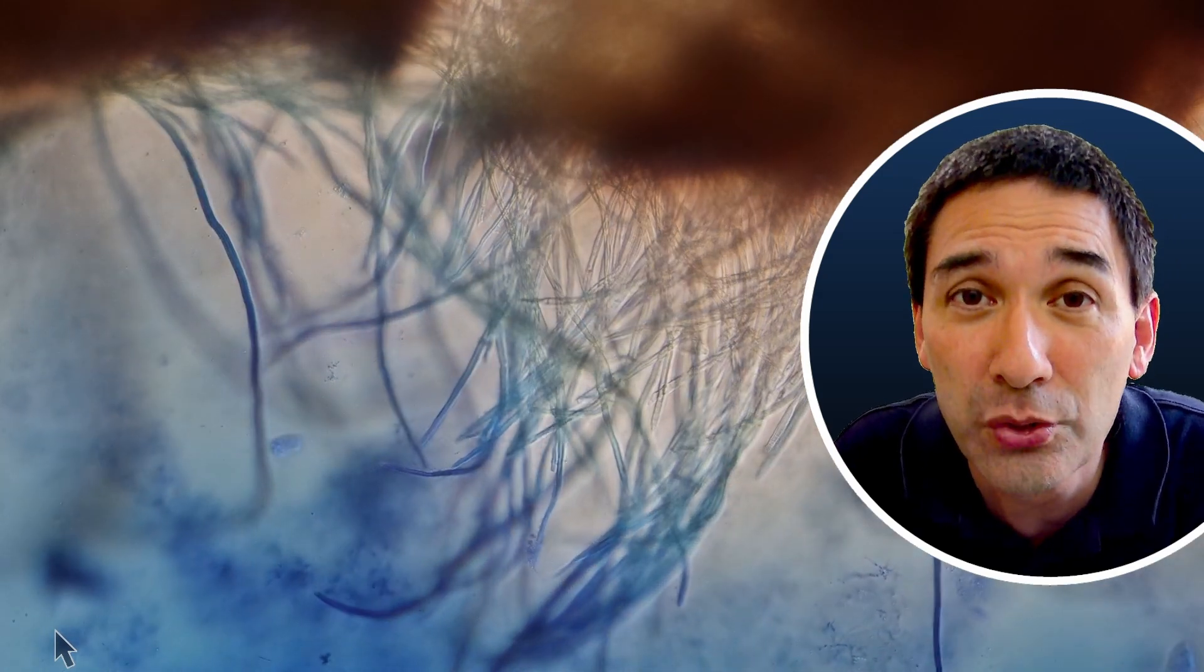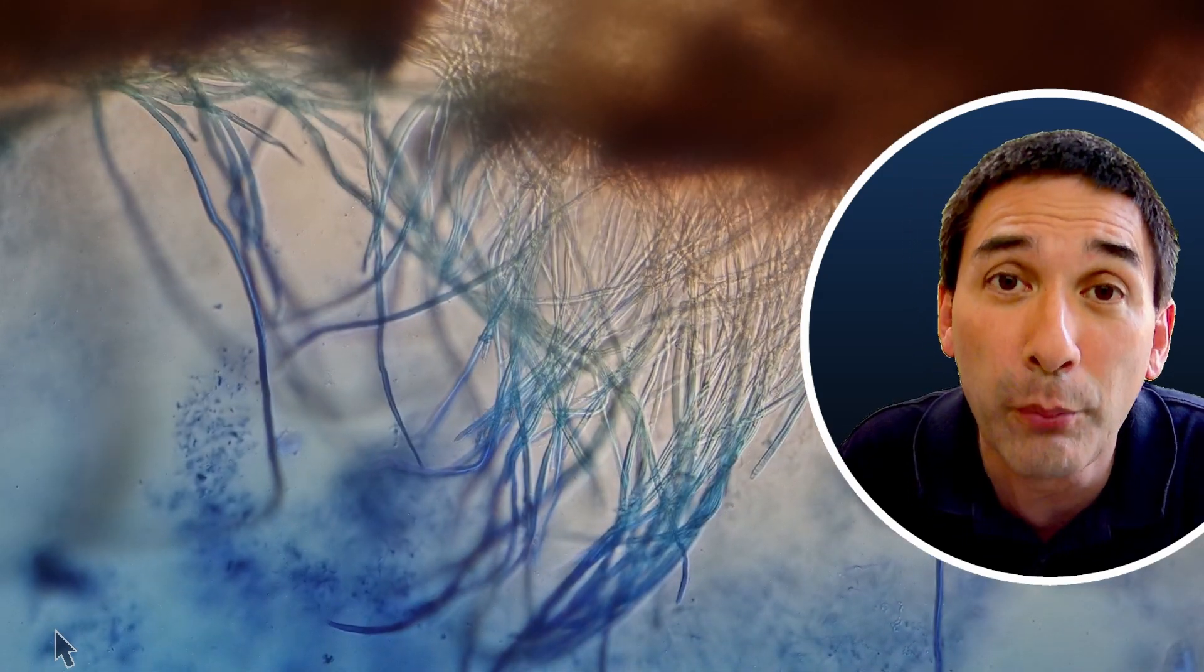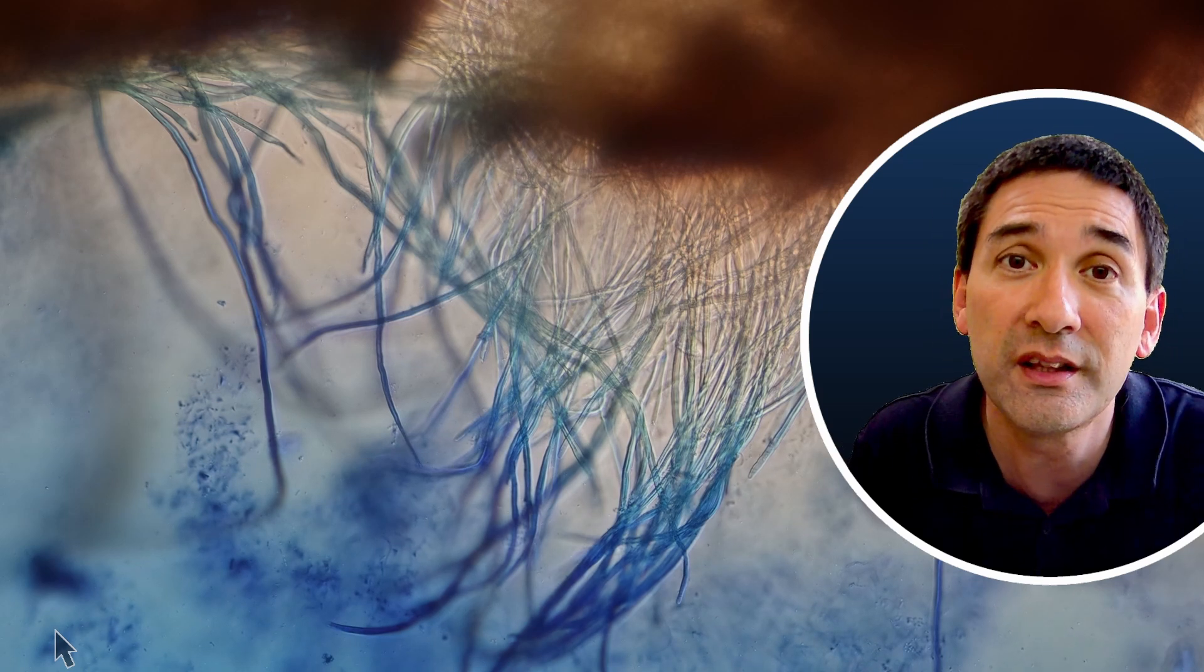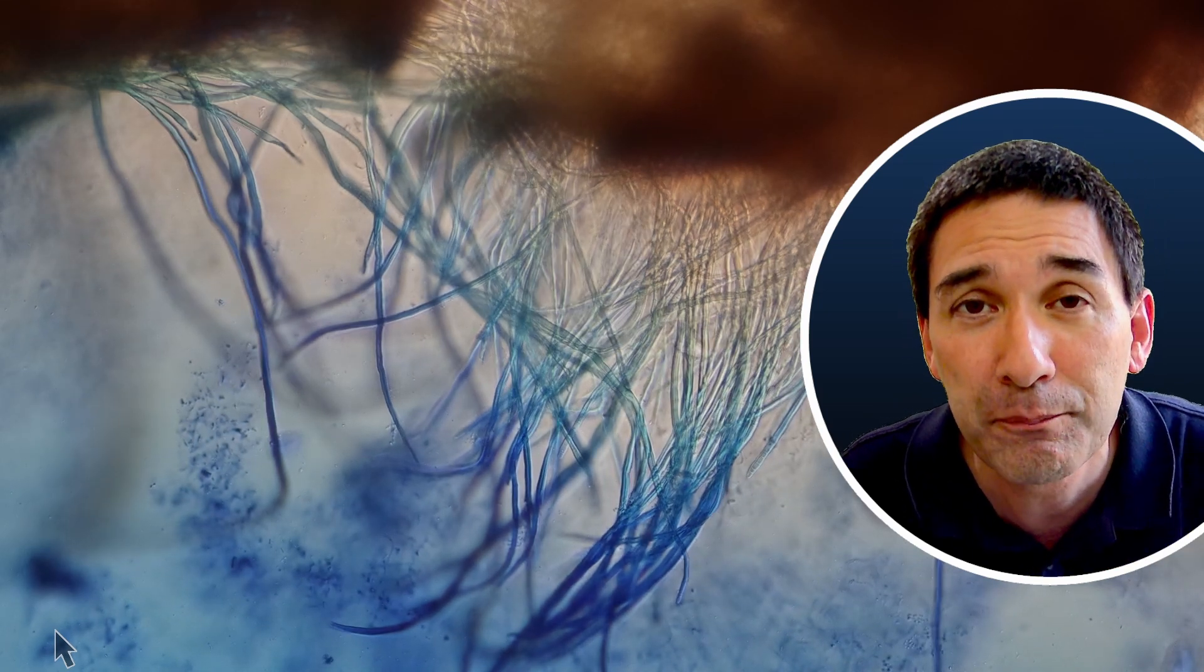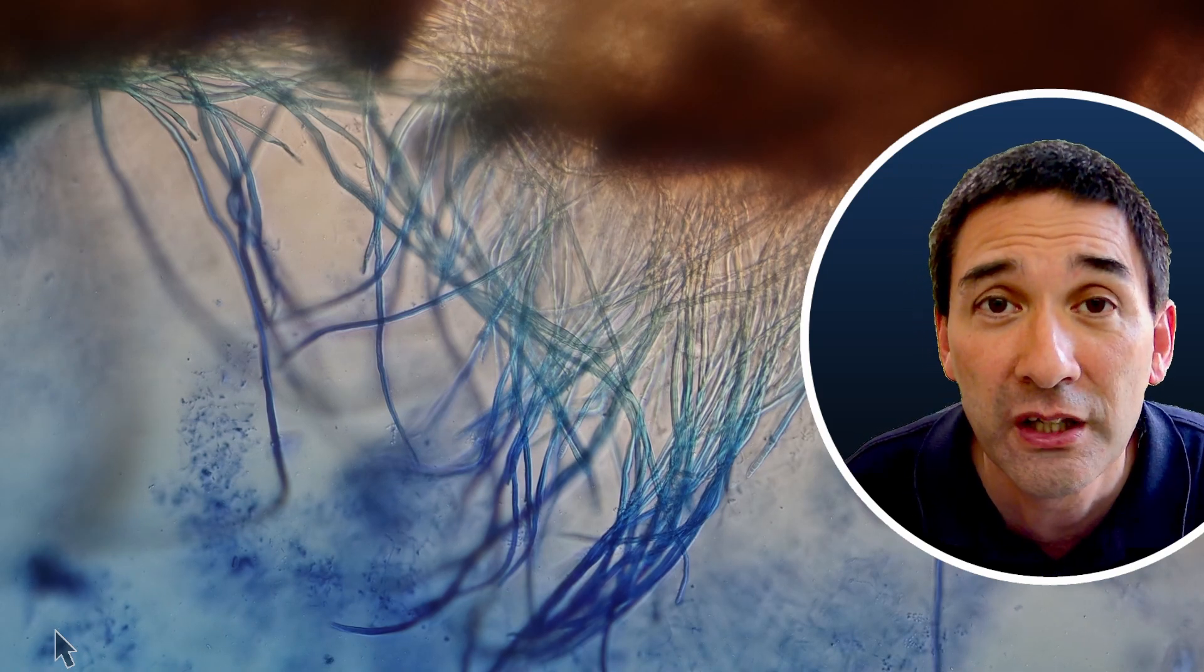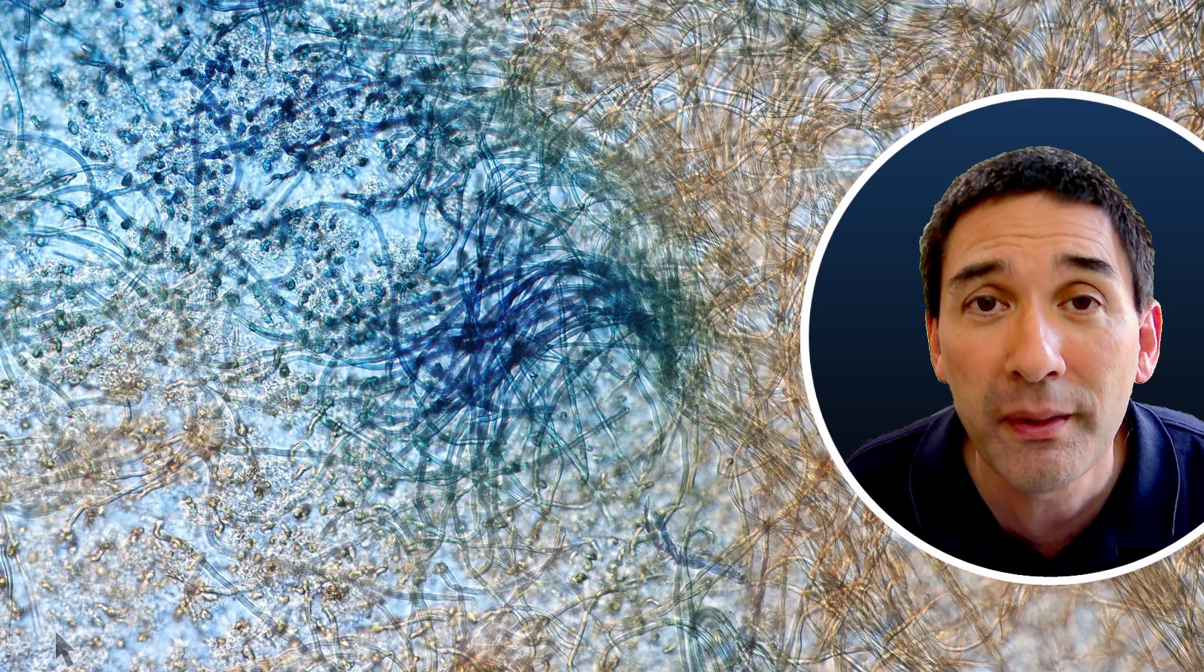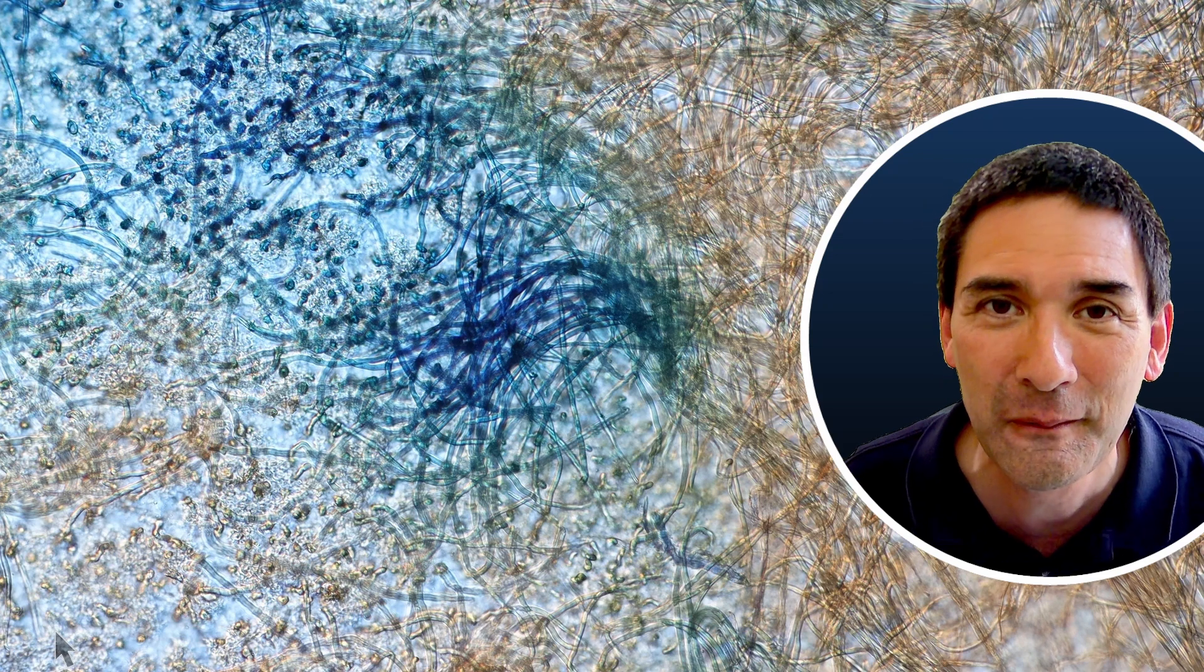Here you see that the methylene blue starts to stain the hyphae from the bottom upwards. And you can also see that the stain travels along inside the cytoplasm of the hyphae because of the lack of cross divisions. This is the reason why substances can be transported quite quickly inside the hyphae. And here we can also see that where the methylene blue contacted the cells, this is where it started to stain quite well. But I think you do not need to stain it. You can also see it quite well without a stain.